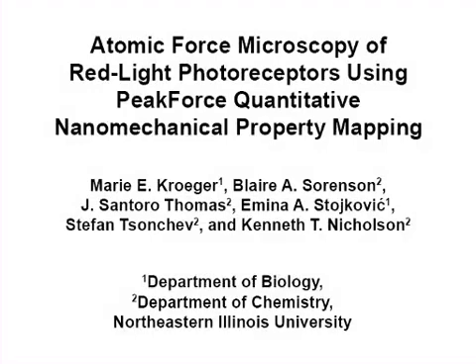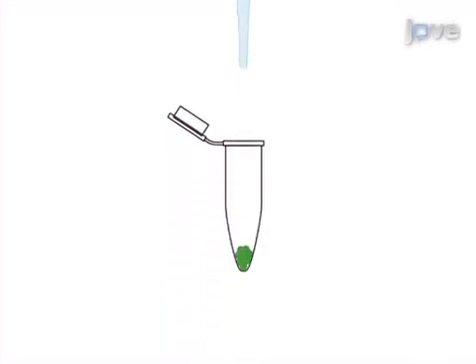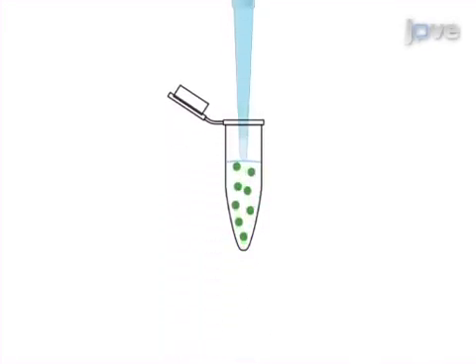The overall goal of this procedure is to collect high-resolution images of photoreceptor proteins using atomic force microscopy. This is accomplished by first obtaining a sample of the photoreceptor and diluting it.